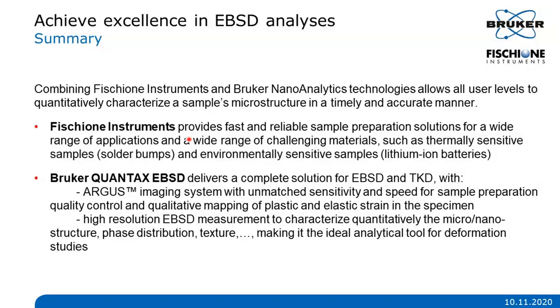So I'll start with an EBSD question. Can we use mechanical polishing to prepare samples for EBSD analysis? So yes, for many of them, but like Pavel has shown you at the beginning of this presentation, you have to be very careful. Soft materials cannot be prepared, and materials with phases of different hardness and very fine microstructure cannot be prepared by mechanical polishing alone. Those will require broad ion beam milling.